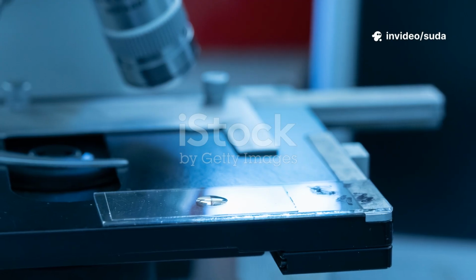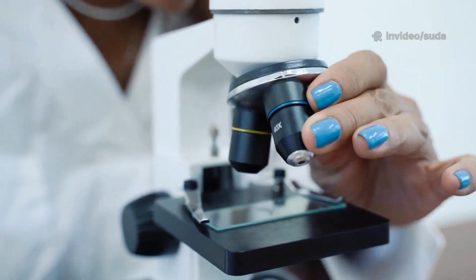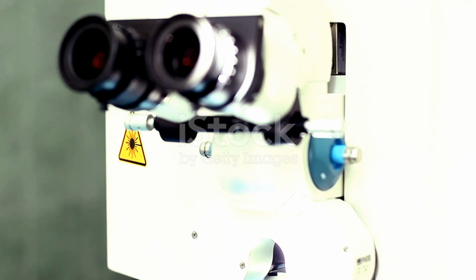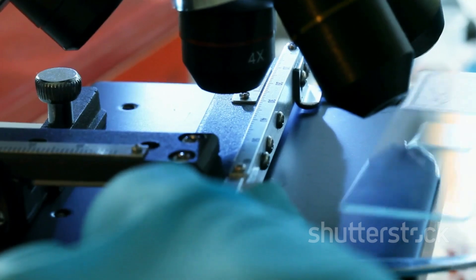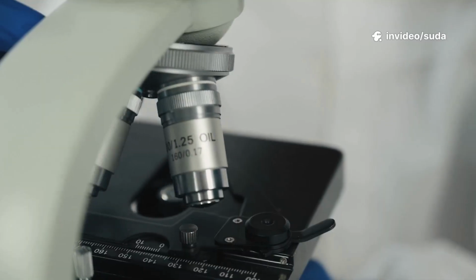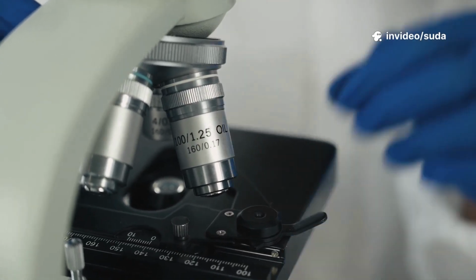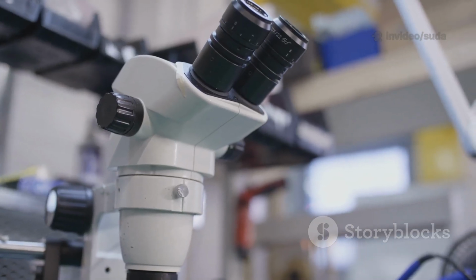Place the slide, secure the clips, and turn on the light. Start on the lowest power, 4x. Look through the eyepiece and keep both eyes open. Use the coarse knob to bring the specimen into view. It may be blurry. Once you see it, stop coarse focus. Use only the fine knob. Gently fine-tune until the image is sharp.